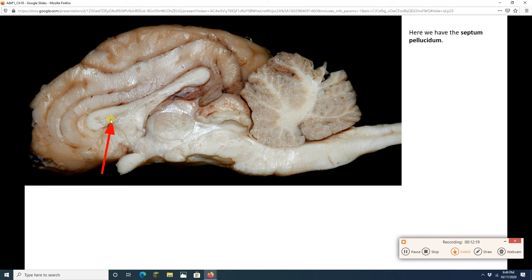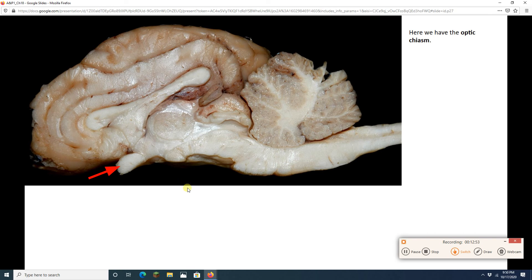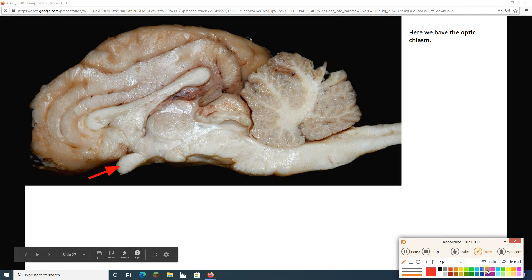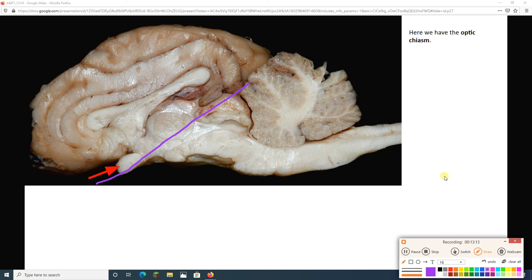This shiny bit right here is the septum pellucidum. If you were to poke through it with a scalpel, you could get into the lateral ventricle. This white area here is the fornix — another group of white matter connecting the cerebrum basically to the diencephalon. If we keep going, we see the optic chiasm right there. I always recommend finding the optic chiasm in the mid-sagittal slice because there's a beautiful diagonal line you're going to take from there.